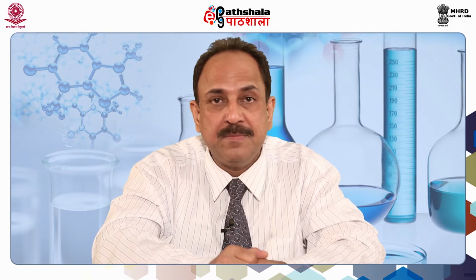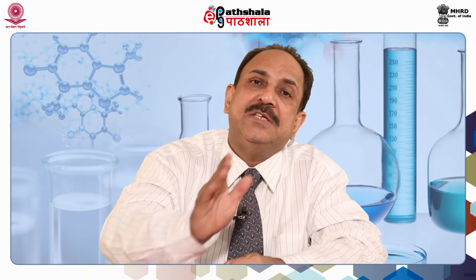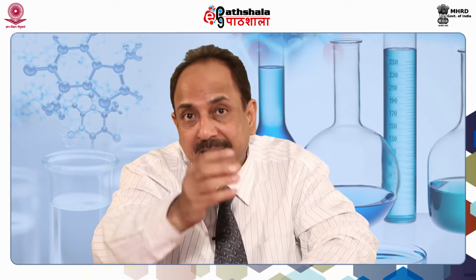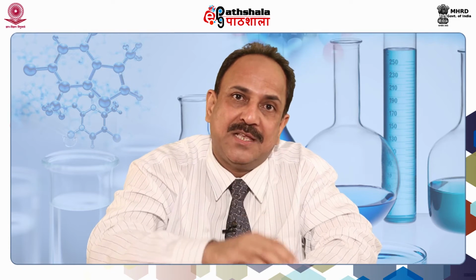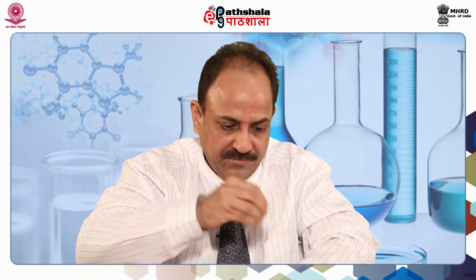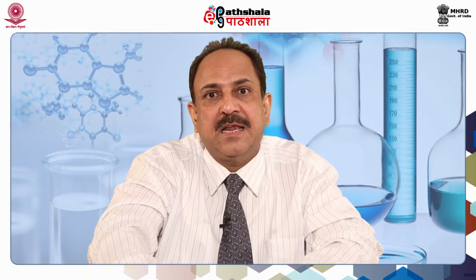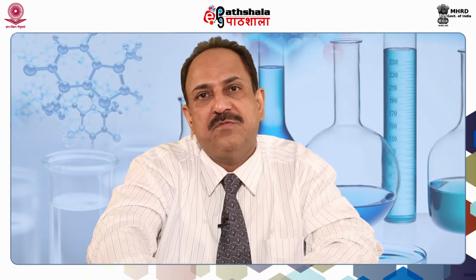So, while analyzing the active site, it is not that we will be using the width or the height. We would like to see the actual depth of the molecule. We would like to see at which position in the core or surface the residue is sitting, whether it is in front, within or at the back of the molecule. So, this is the application which allows the real three-dimensional visualization of the molecular structure.